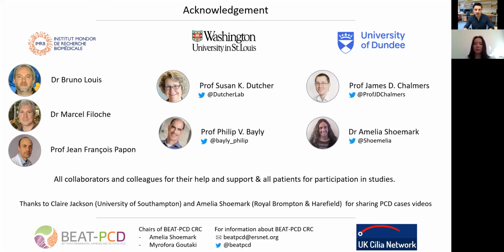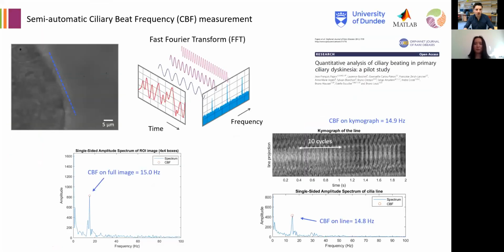So I would say that normally ciliary beat frequency analysis is pretty reliable, because you can do it from top view, from side view, or somewhere in the middle. You are really looking at something that is coming in and out of focus, which has an effect on the level of gray.